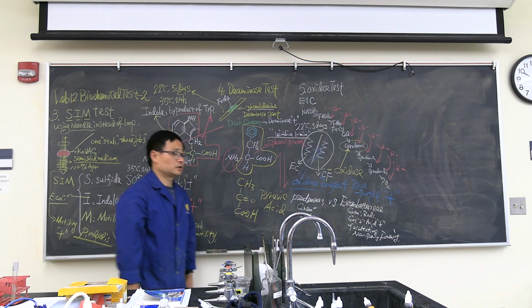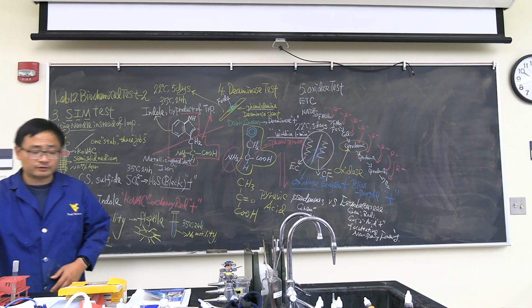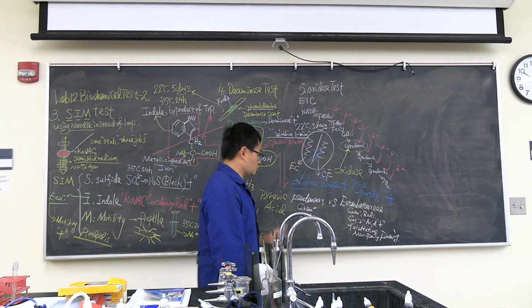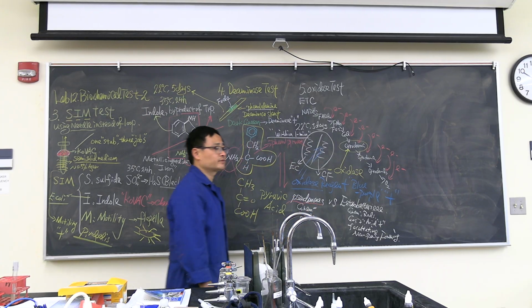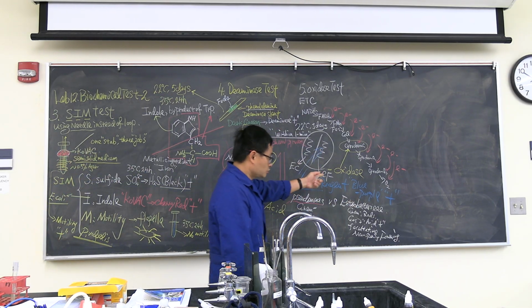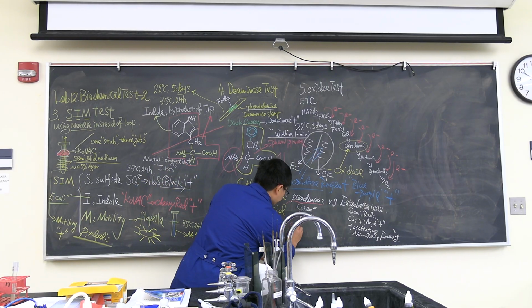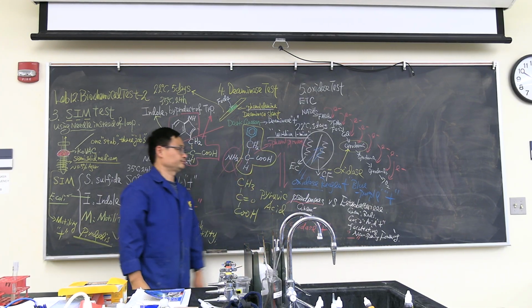Which means if we do a gram stain, they look very similar sometimes. That's why we do an oxidase test. Plus, Pseudomonas is a strict aerobic bacteria. They must use oxygen. They must go through the standard electron transport chain. So, Pseudomonas is oxidase test positive. This whole group is negative.